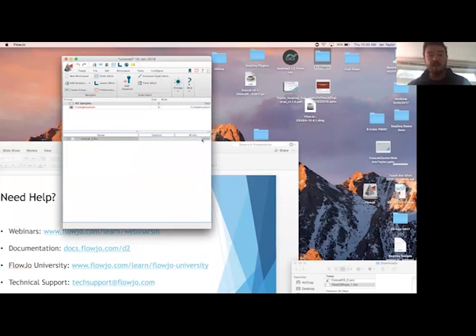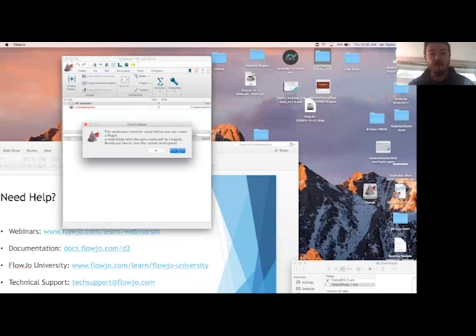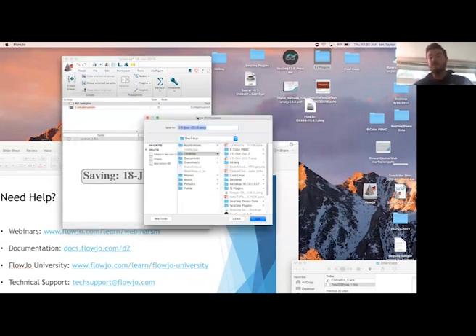But we've generated a new concatenated data file that contains 18,000 events randomly from those tSNE populations that we identified previously. Now let's go ahead and perform the tSNE mapping so we can cluster on the data. So again, if I've selected the data file, I should be able to access in the plugins tool the tSNE option. It'll ask you to save your workspace before you calculate tSNE. This is so that there's a location where all of these tSNE artifacts can be located. And in this case, I'll put it in my downloads folder again, where I like to place stuff.